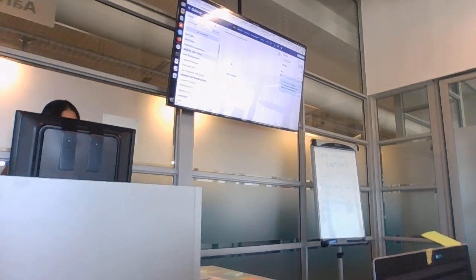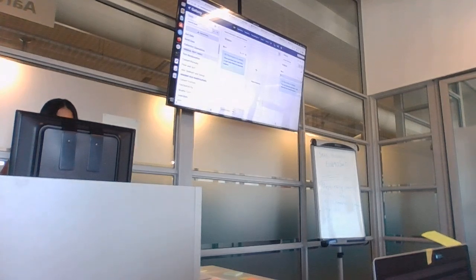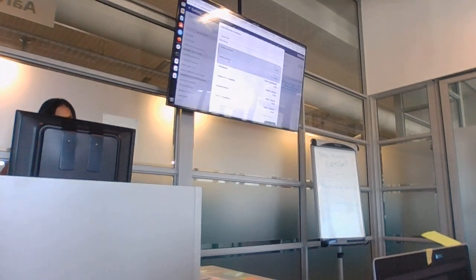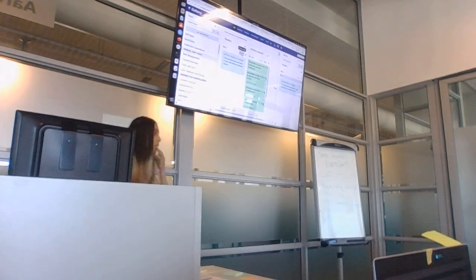You should have something here, possibly already, maybe your Kraken one showing. But we're going to select a second history here. If you click on this block, find the cholera dataset and click on change selected, and you should be able to see your Kraken and your cholera dataset side by side.